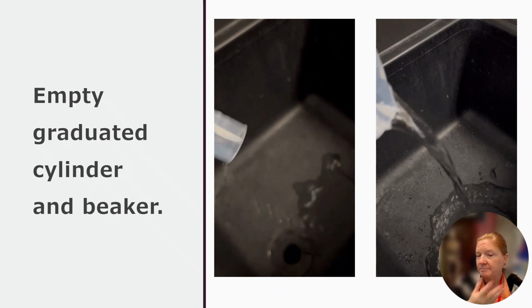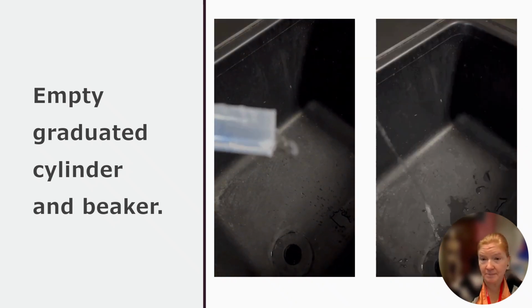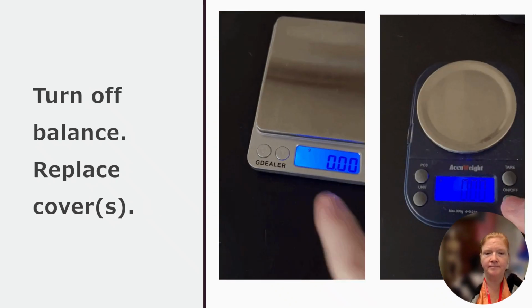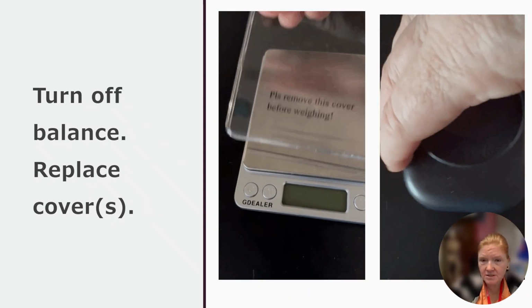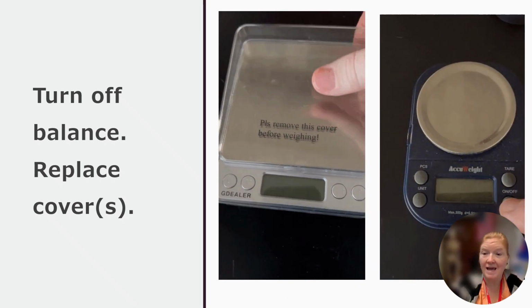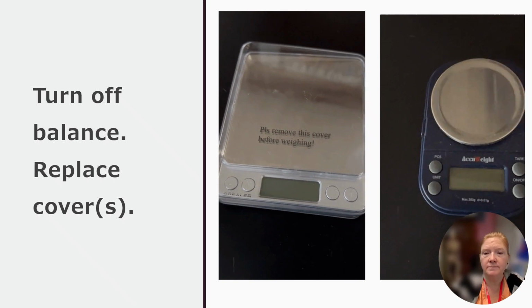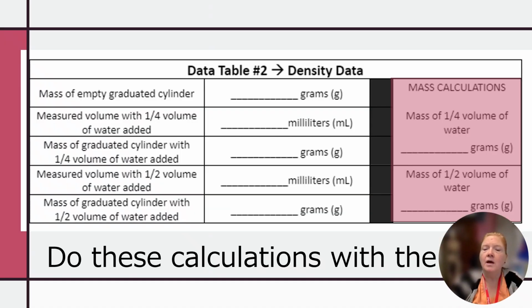Okay. Now, in lab, you're going to empty the graduated cylinder, empty the beaker, turn off the balance, replace the covers. Okay, remember the silver one has 2 covers, the smaller one has 1. Return all of your materials. Now we're going to do some calculations.